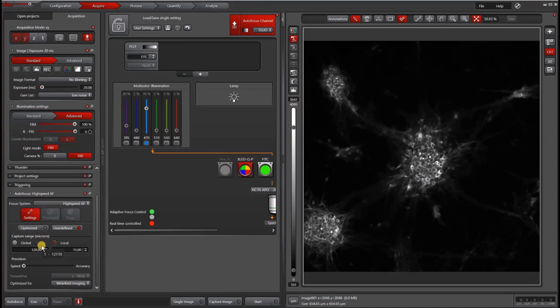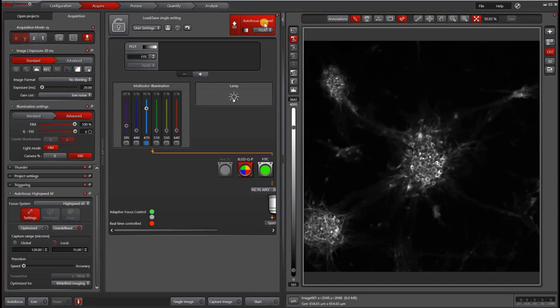If you've selected high-speed autofocus, a channel will pop up in your light path on the top right corner allowing you to customize your autofocus settings. If you're using best focus, you will not have this option and most people will use the first channel in their acquisition as the autofocus channel.